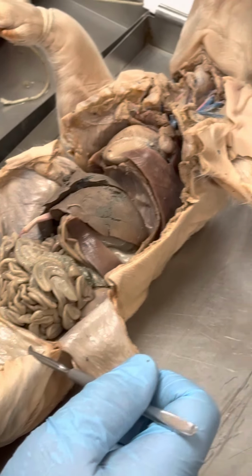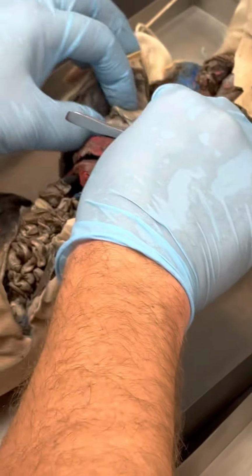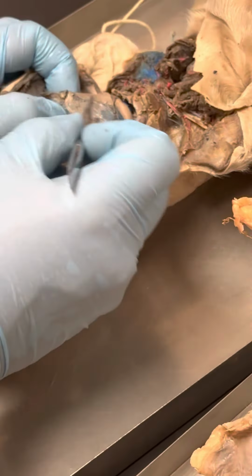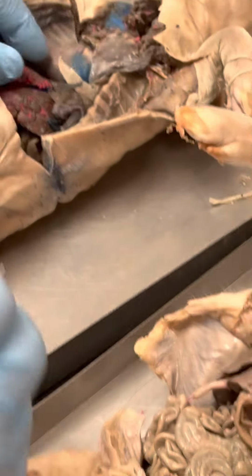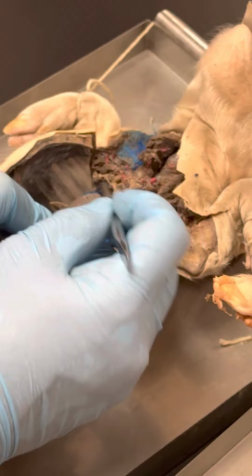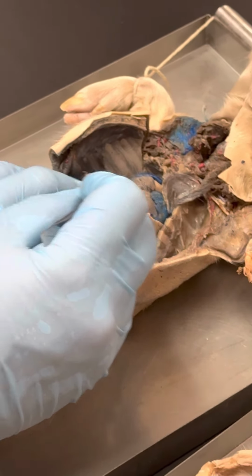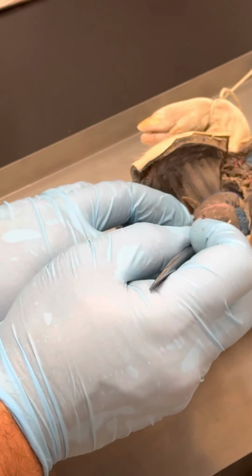Pericardium. So around the heart, you have a pericardial sac. Not on that one. But right here, I'm going to put it back together. Here's your pericardial sac. Atrias, left and right. So here's our right atria. On this one, you could definitely see the atrias. They're blue. Right atria, left atria. Did I just say right for that side? Mm-hmm. Oh, okay, just making sure, because that is the right side. Right atria, left atria, right ventricle, left ventricle.